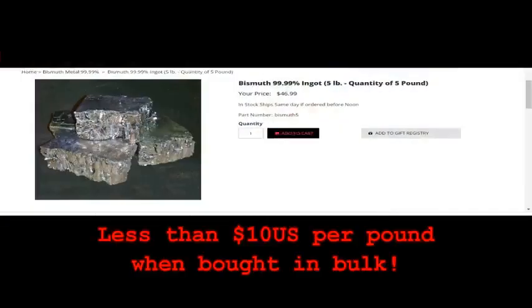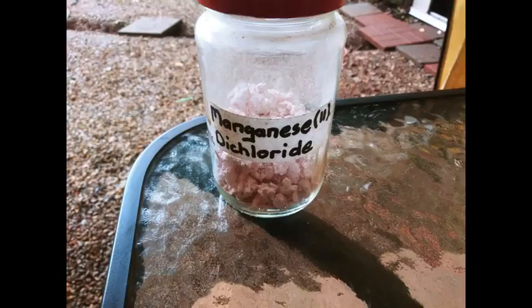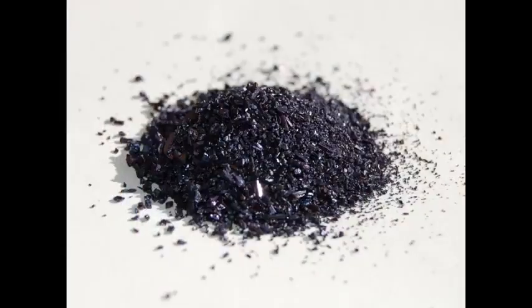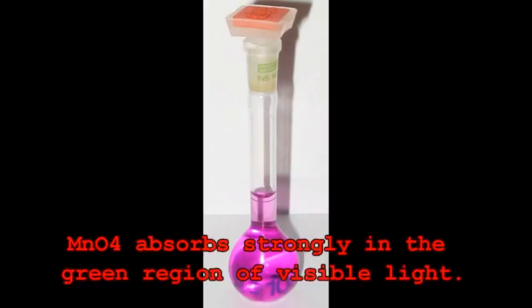While bismuth itself is cheap and readily available, the alkali bismuthates are very much harder to come by for the home chemist. This is mostly because sodium and potassium bismuthate are very powerful oxidizers. For example, both salts can oxidize manganese dichloride to permanganate and chlorine gas in room temperature sulfuric acid. In fact, it converts almost any manganese salt to permanganate, and this was used as the basis of an older laboratory method to detect manganese salts present in a sample spectrophotometrically.